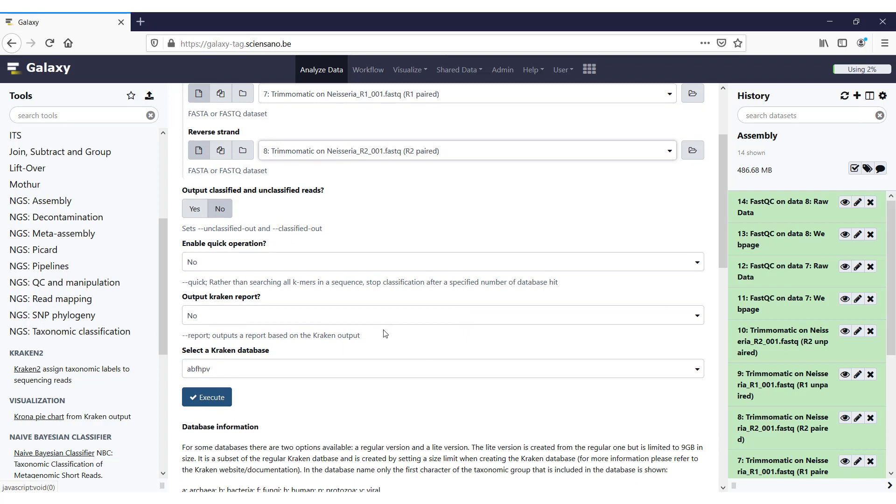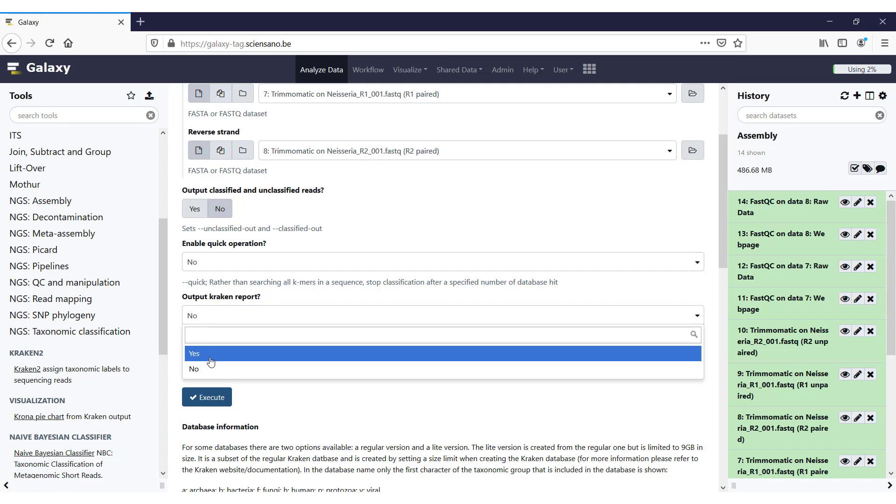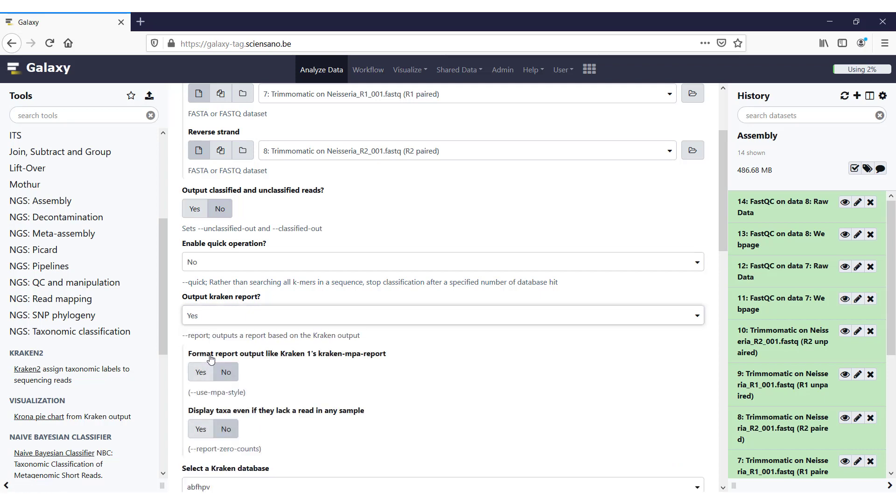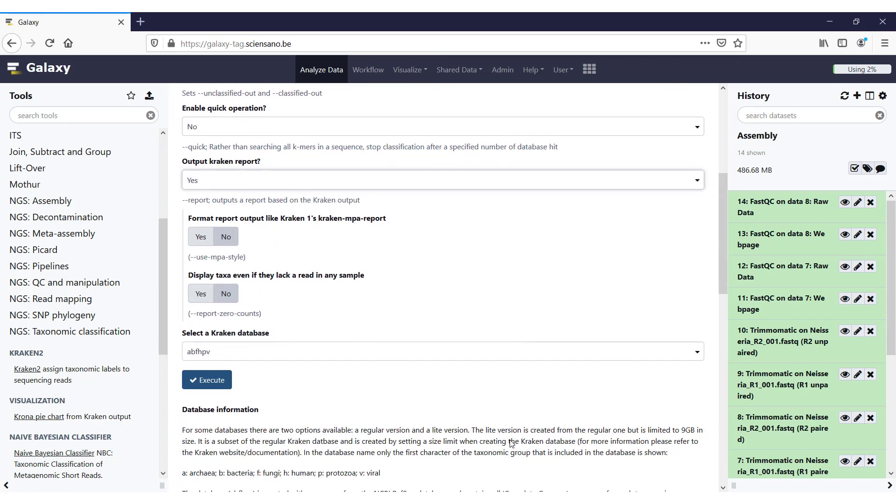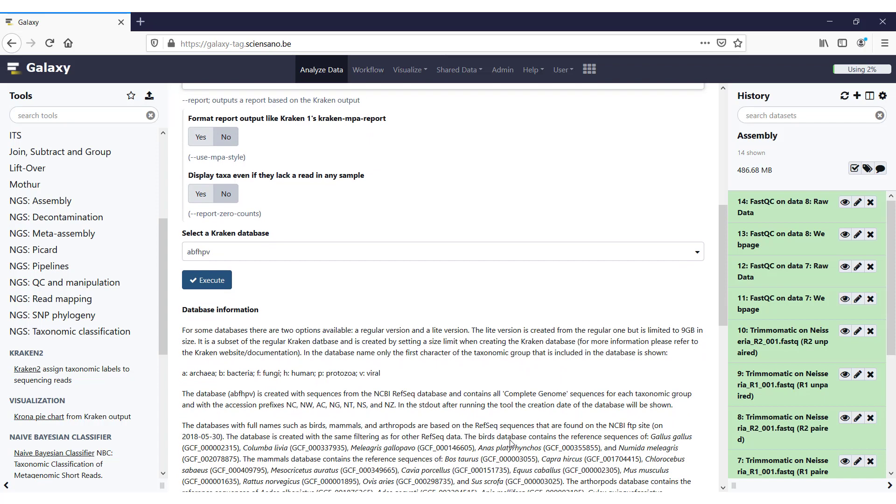We can set a number of options. An important one is output Kraken report. By default it says no, but we're going to put this to yes now, and I'll explain later on why this is necessary. And then we can select also a database. By default the ABFHPV is selected.